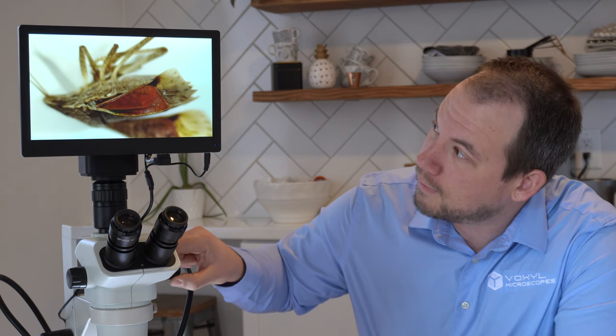So now we have the Excellus 4K hooked up to the stereoscope, which is the AccuScope 3075. You can see the live preview here. If I zoom in and I zoom out, I have a nice 4K image at 30 frames per second. And even though we're not connected to a PC, we still have complete camera control. We can capture 8 megapixel images, we can capture 4K video, all directly to a USB jump drive.